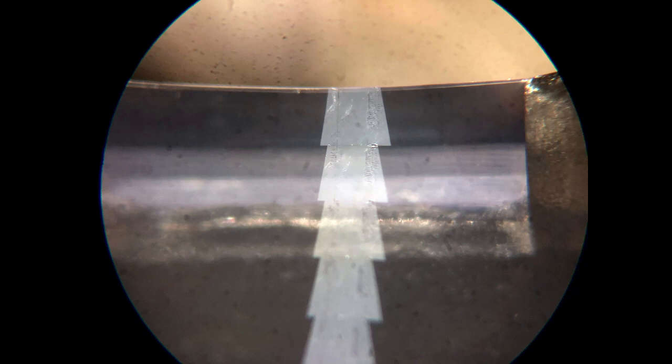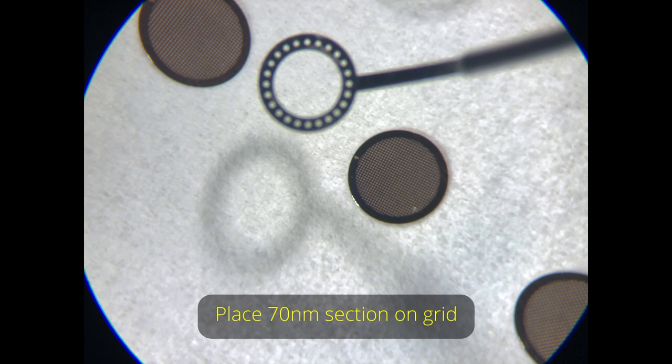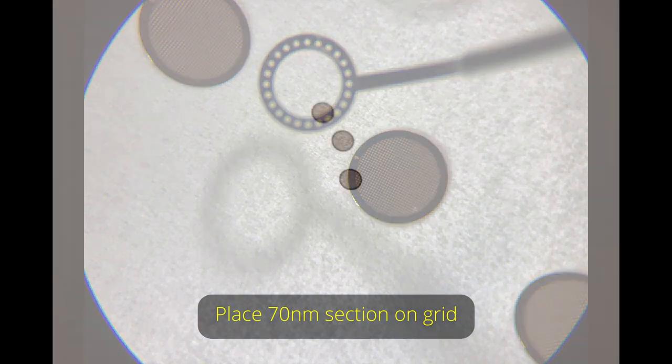So then we're going to separate these sections, pick them up with our loop, and place them on grids.